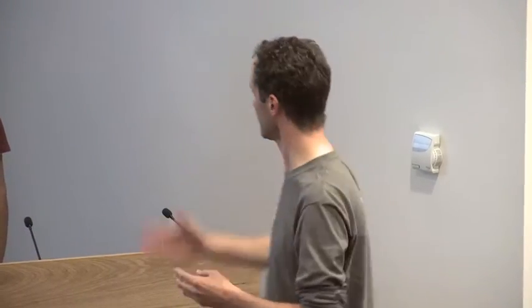And Paula, in her lecture, already mentioned that tomography, subtomogram averaging, could be used for initial models for single particle analysis. But there are many problems in biology where it's not easy to make many copies which are structurally the same. So you could do averaging over projections of copies of the same structural thing. But if there's something that doesn't repeat itself, like an entire cell or an organelle, then tomography provides the unique opportunities to study that. But I'm sure Tanmay will discuss that with you.